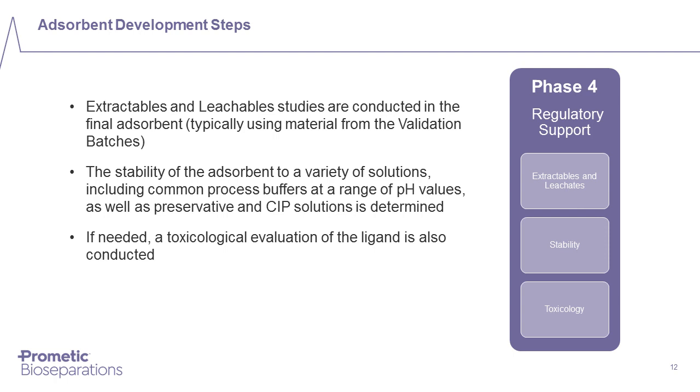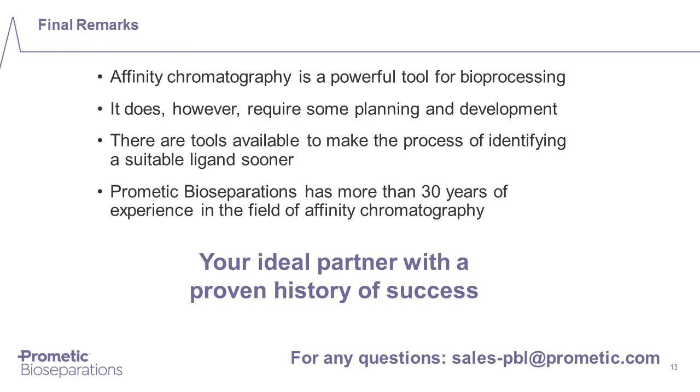So in conjunction with that, we also have phase 4, which are the activities that need some of the material that is produced in phase 3 to really work. In this, we include the extractables and leachables studies for the final version of the adsorbent, as well as the stability of the material, the shelf life, and the different conditions. And if needed, depending on the nature of the ligand, a toxicological evaluation of the adsorbent and the ligand in some respects.